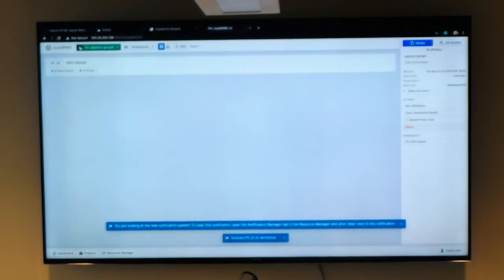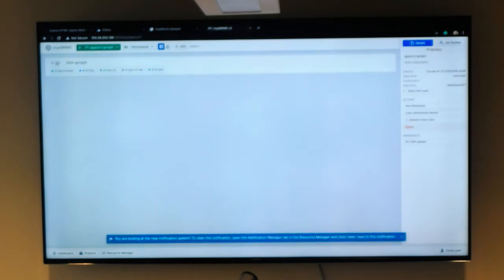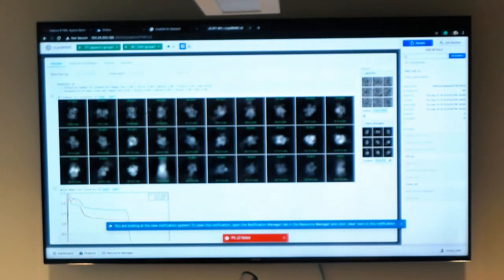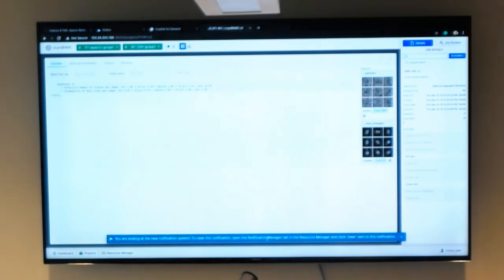The main thing is that CryoSPARC is fast, such that you may be able to try doing a run in more than one way, meaning you might be able to try different parameters. So please do go around, and we'll go around and see where people get stuck. One thing you might find useful is that you can see this feedback. Oh, I see some people's jobs failed, and that's a good thing. We'll walk around and try to resolve any issues as we find them.